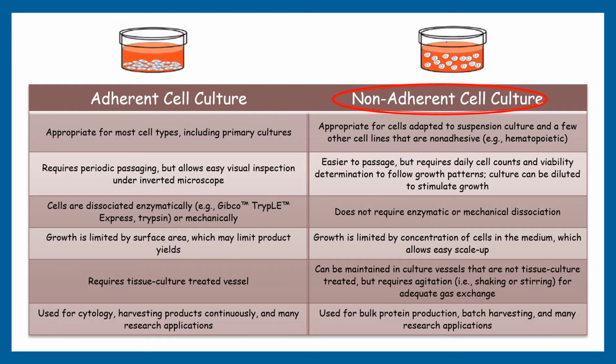Example, lymphocytes. Generally, the plate needs to be coated with extracellular proteins like laminin and fibronectin so that these types of cells get attached at the bottom of the plate easily and grow. Although non-adherent or suspension cells do not need any such substrate to grow, they float in a medium and many require agitation for adequate gas exchange.